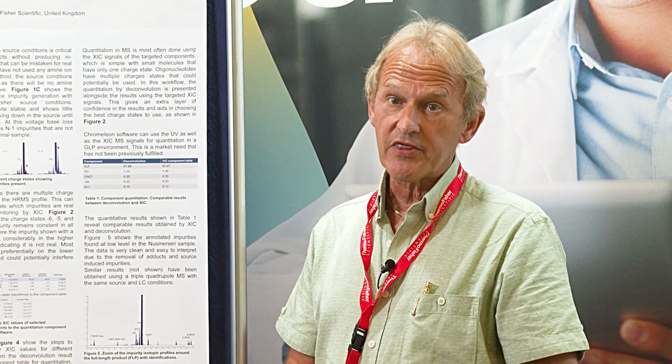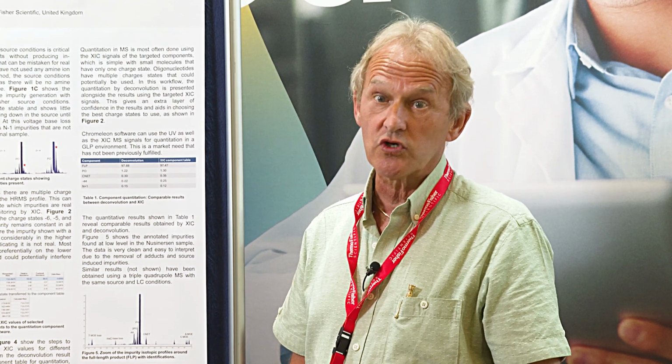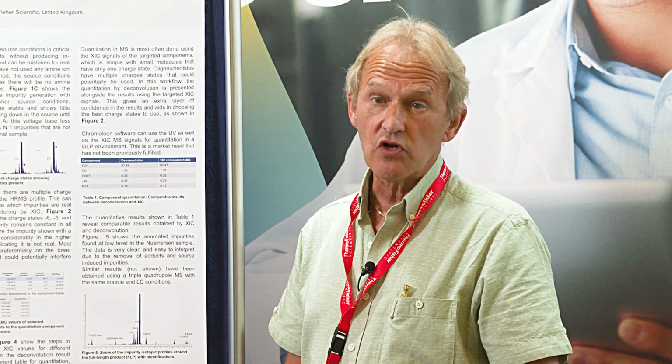If you look at a method now that just uses a simple ammonium acetate eluent with reverse phase, if you can eliminate, by cleaning the HPLCs, all the metal adducts, we've now got high sensitivity because we haven't got salts in high concentrations. We're not using high solvents. Solvent concentration just goes up to 30%.